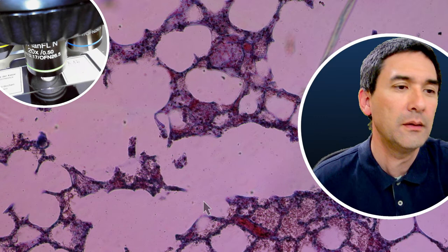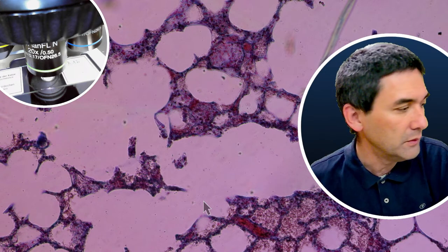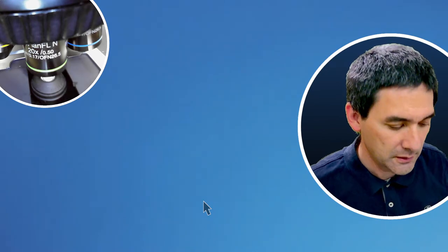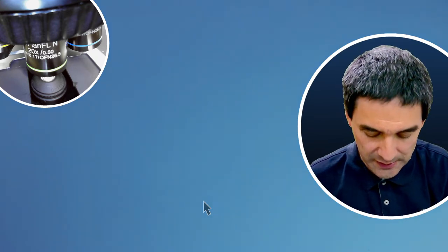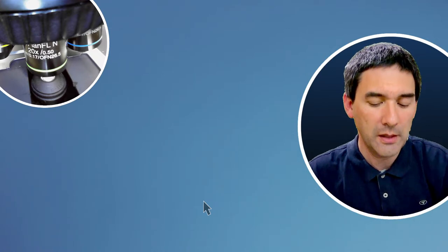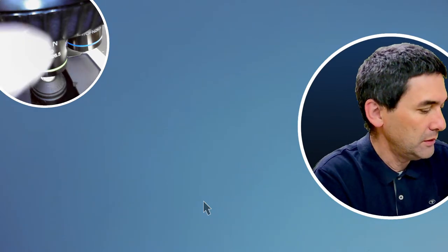I put my fungi slides somewhere over there, and I don't remember which one it is from last week. So you know what I'm going to do, I'm going to take it out and... I don't remember, unfortunately. See, always label your slides. Always label your slides. Because I made several permanent slides, and now I don't remember what it is. But there is another slide I just want to show you, which I did label.